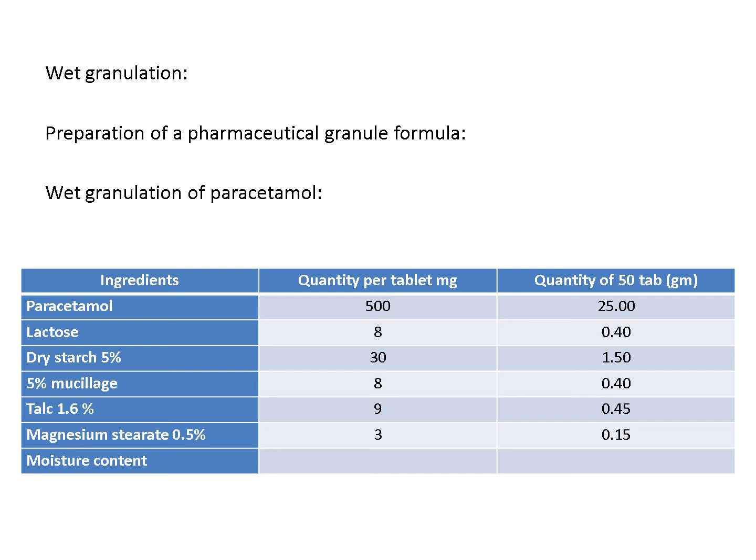We mix the three powders in a mortar using a spatula, because these powders are very fine, using the geometrical technique, starting with lactose and doubling it with dry starch and paracetamol gradually to make a homogeneous mixture. Then we add the whole 8 ml of starch mucilage and make a dough. The dough we talked about will be friable.